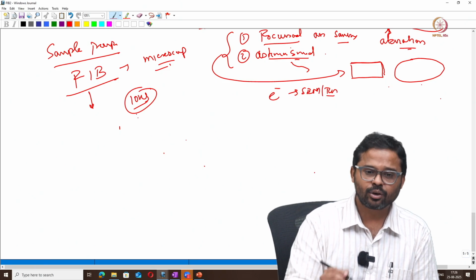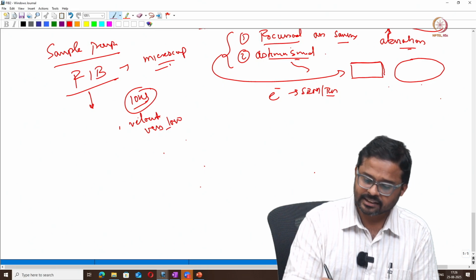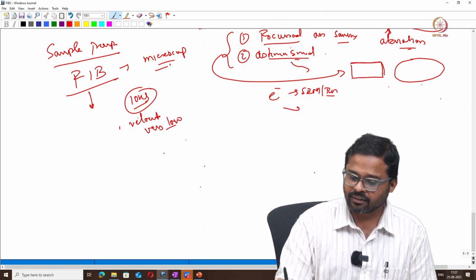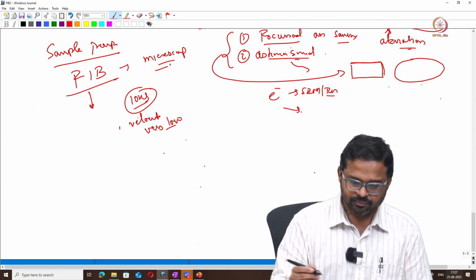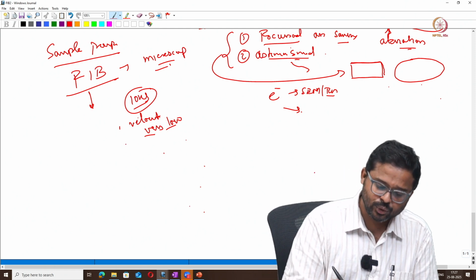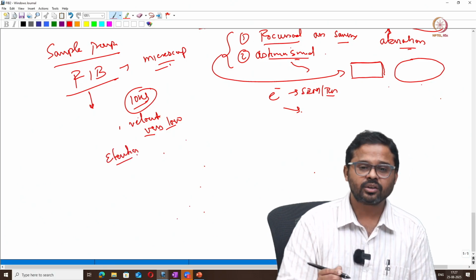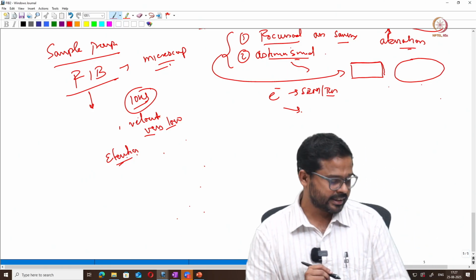It gives better control of the ions because ions are heavy and their velocity is very low compared to electrons, which are fast moving. In electromagnetic lenses, the force on the electrons is proportional to their velocity, but here the velocity is very low, so you would need very large magnetic lenses. Due to this you use electrostatic lenses, which do not depend on the velocity of the charge. So that's why we use electrostatic lenses.